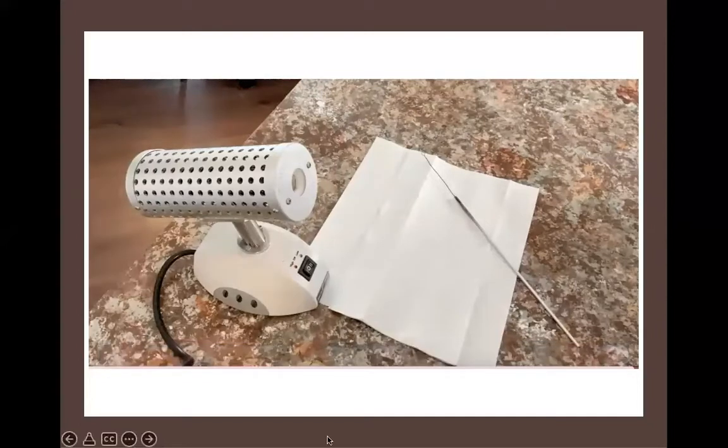When we're working in the microbiology lab, we are often moving bacterial cells from one place to another, from one media to another. And there are different reasons that we do this, but we always have to use our very best aseptic technique while we're transferring cells so that we don't cause contamination to occur.